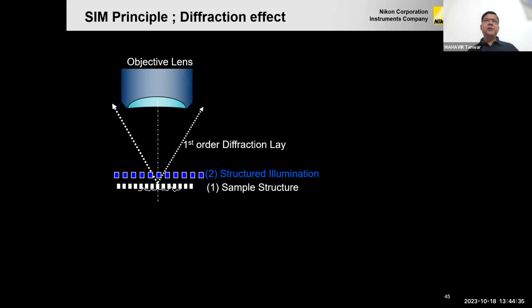And how this works when we capture, let's say, a 3D image, it rotates 5 times in 3 directions. 3 directions means, let's say this is a sample, and we are moving in direction 1, direction 2, direction 3, so that the image coming from behind the sample should also be covered. So we have to capture 3 phases and 5 images. So 15 images to capture 3D, and 3 by 3, 3 directions and 3 images in XY, just a 2D image.